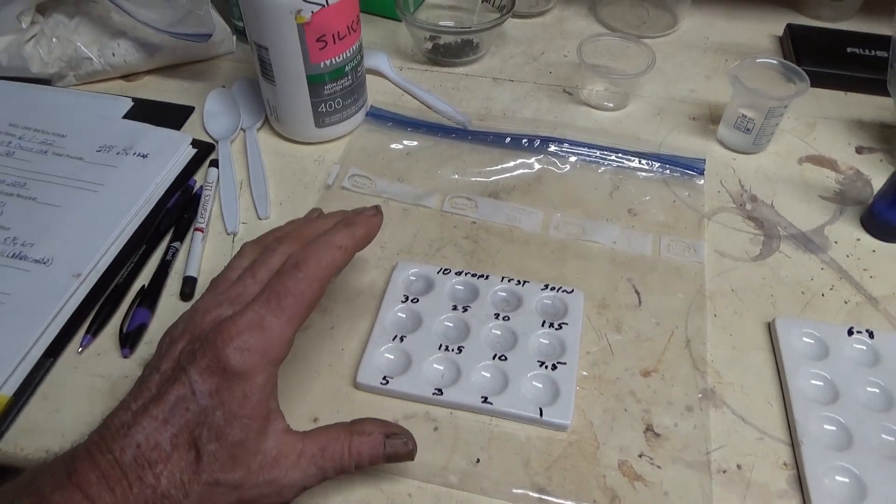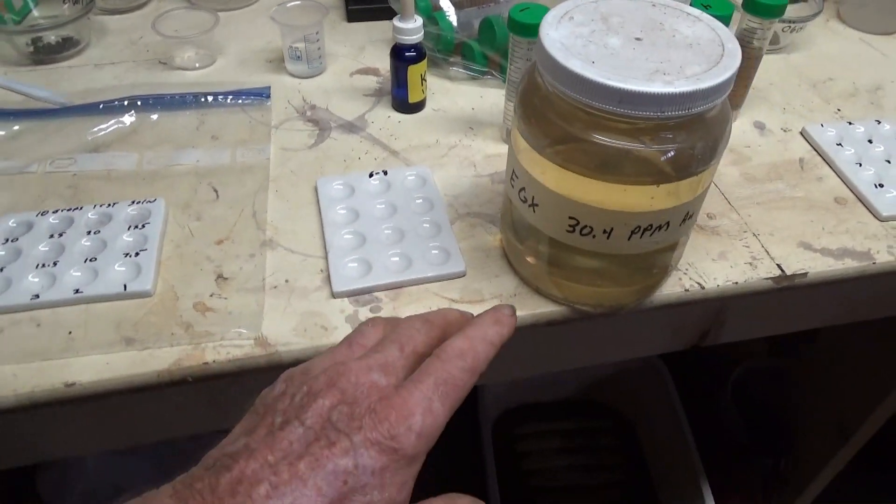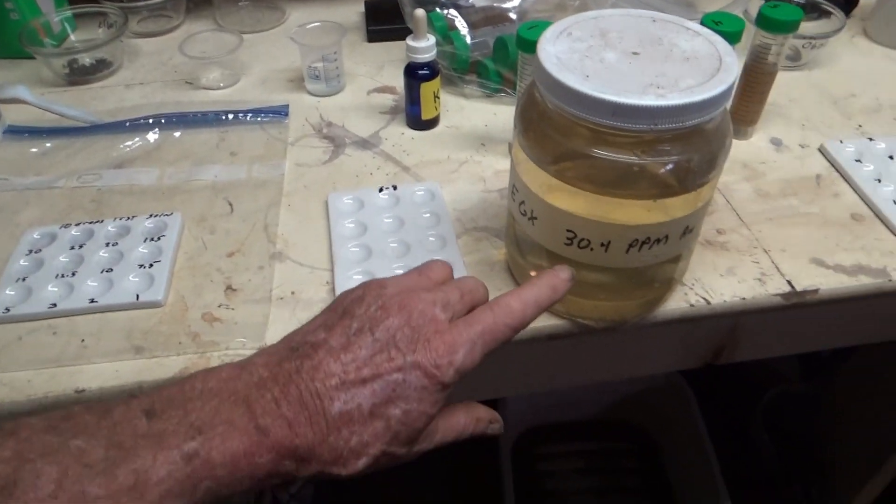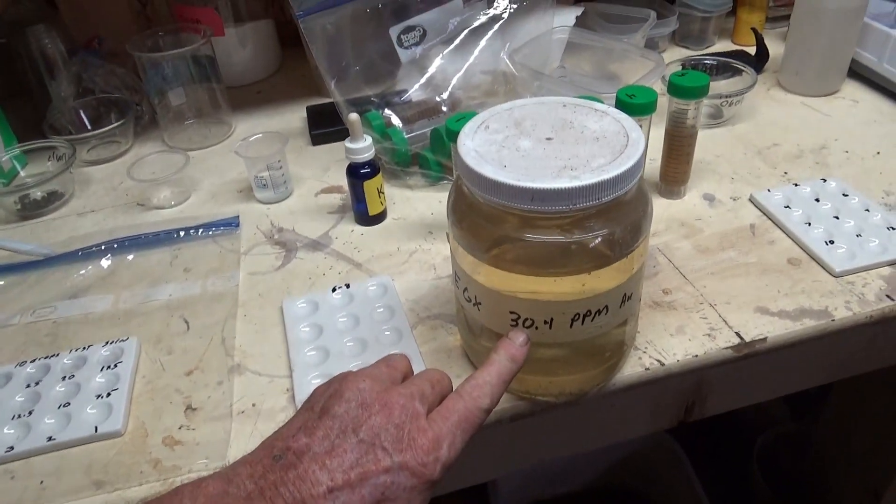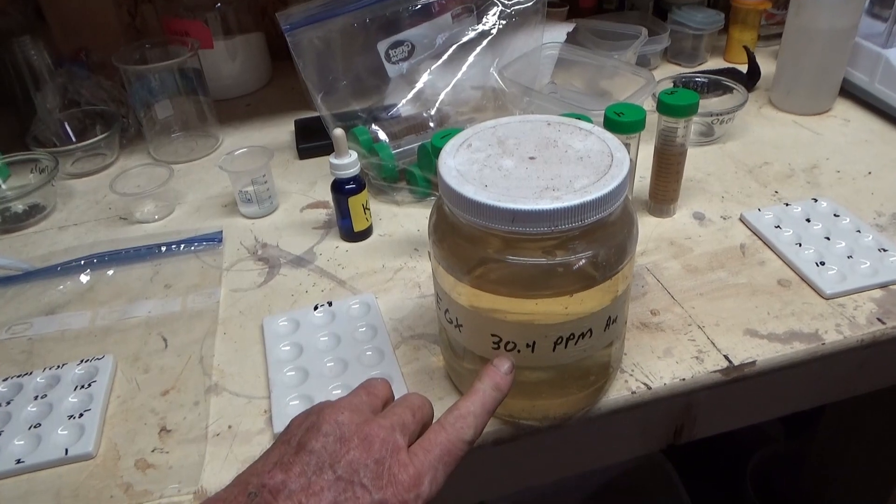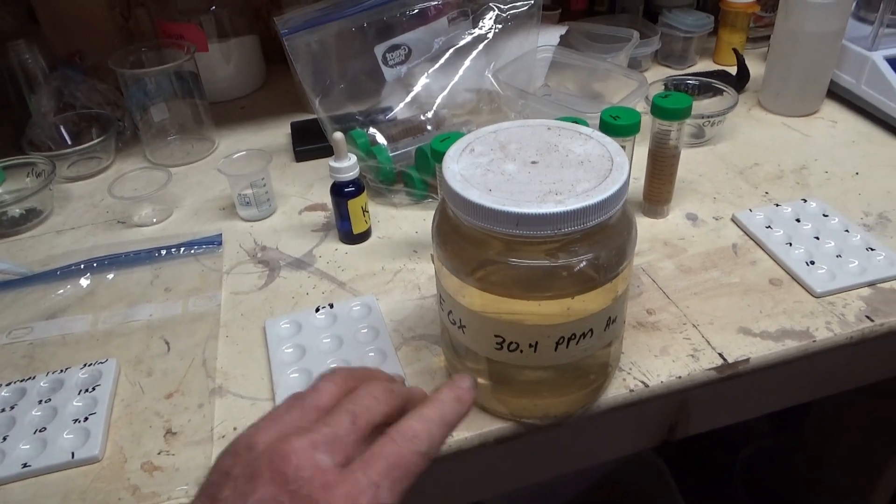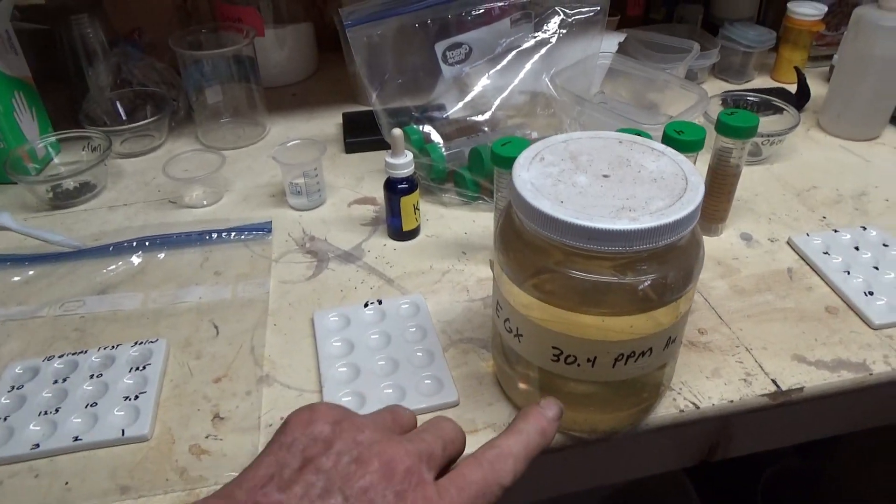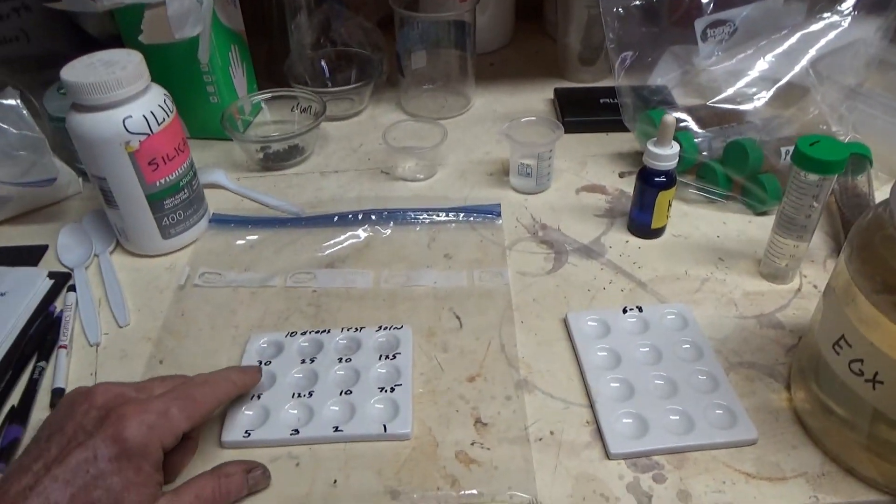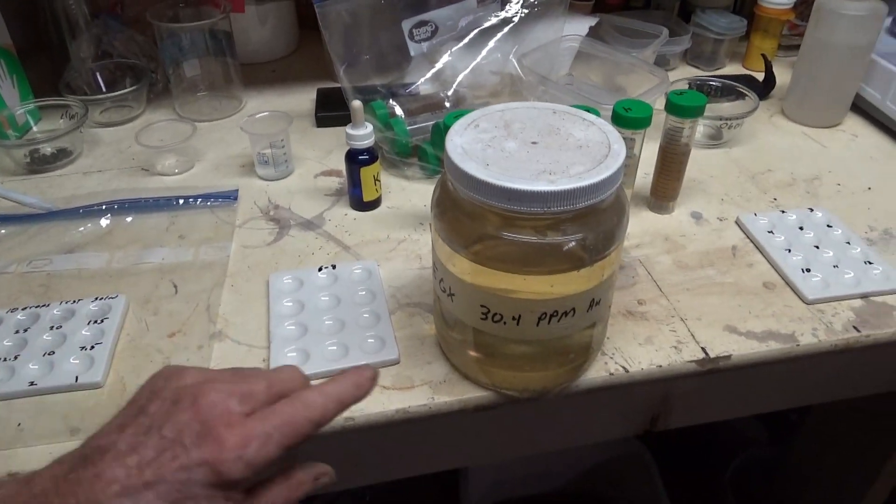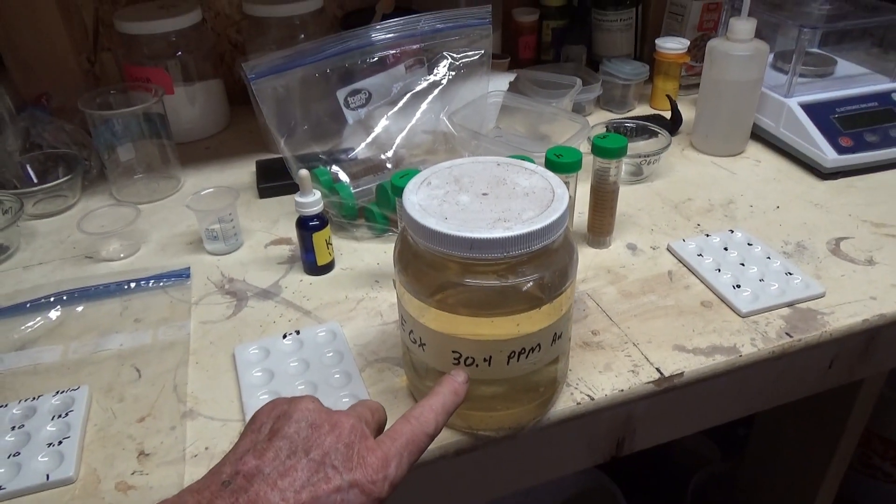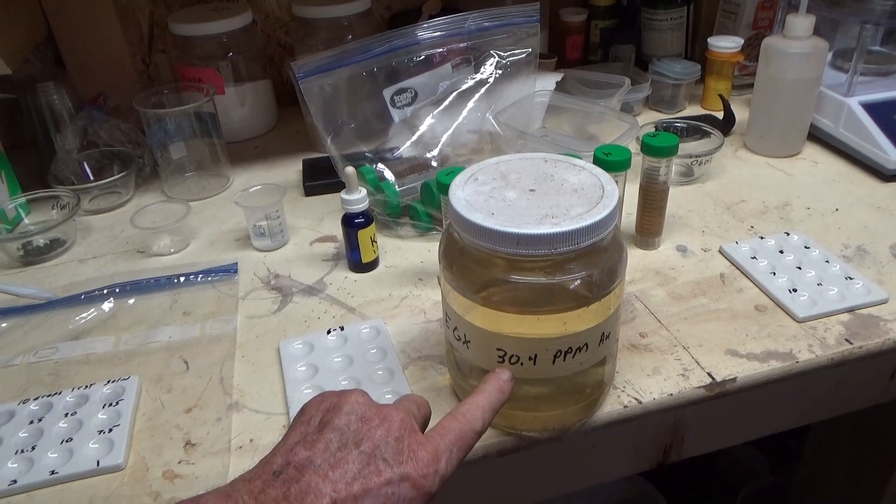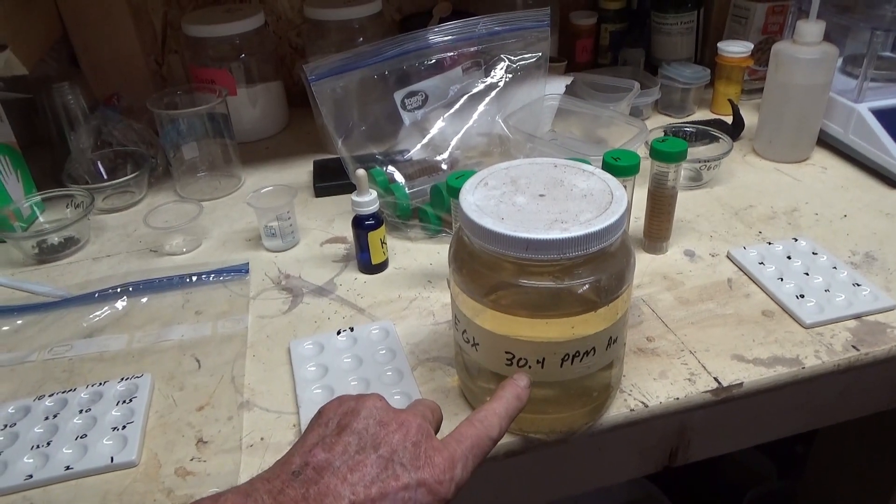The easiest way to do this is quite easy. Since it's 30.4 parts per million, just start with sub-samples of 30 cc's. So you have 30 cc's at 30.4, which is 30 parts per million basically.